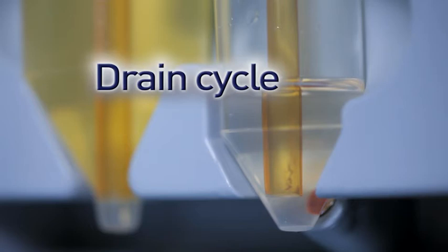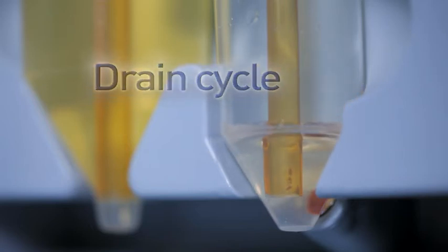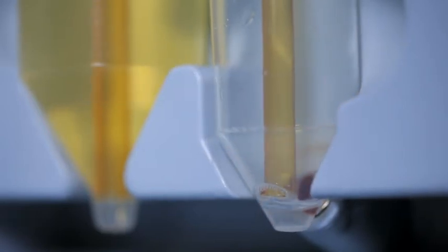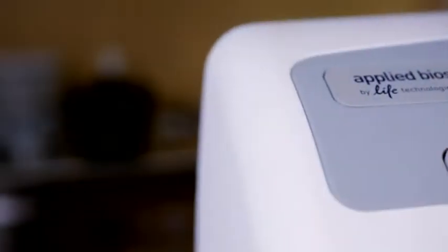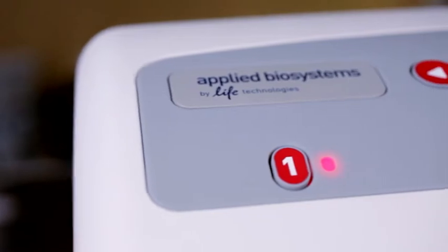The excess PBS will be removed from the elution tube and transferred to the sample tube. All that's left in the elution tube are the auto beads and a small amount of PBS. When the run is completed, a constant red light will appear.